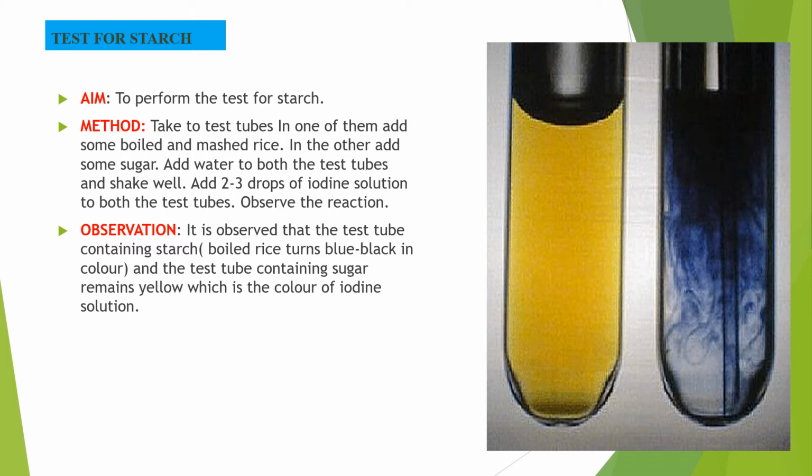Today, we are going to perform certain food tests. You have studied the components and nutrients of food in your last session. Let us perform some tests to prove what the food contains. The first test is test for starch. Let us perform the test for starch.